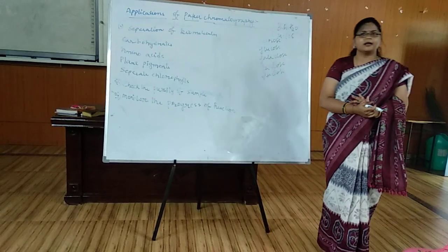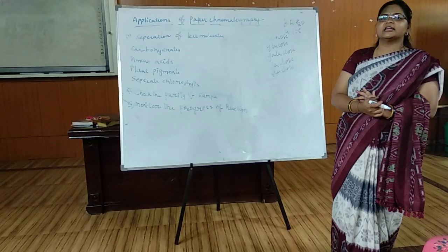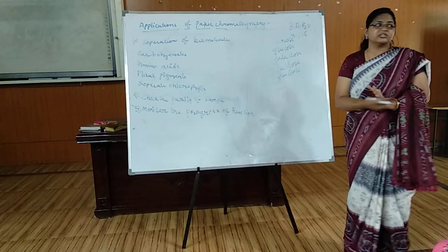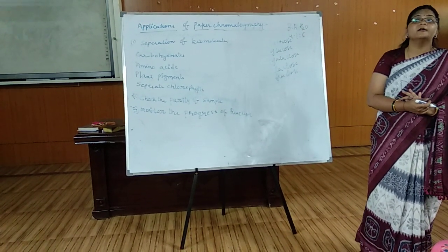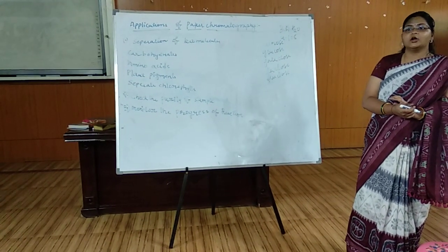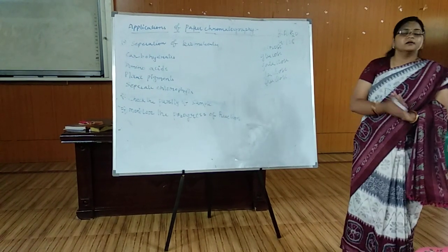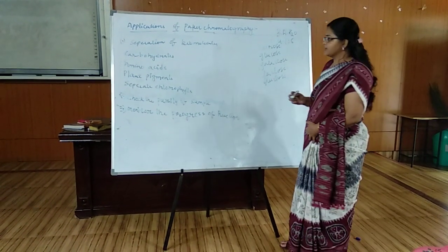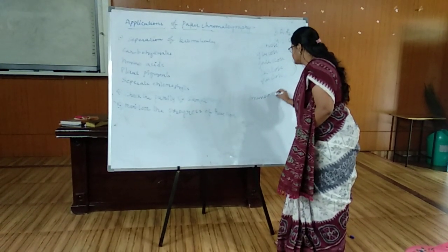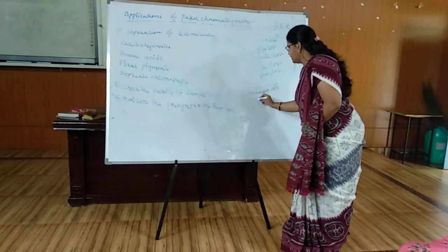Girls, are these sugars colorful or colorless? They are colorless. Then how to detect them? You spray the detecting agents. You can spray Molisch reagent, girls. For the sugars, you can spray simple Molisch reagent or Benedict's reagent, and you can locate the spots of these carbohydrates.